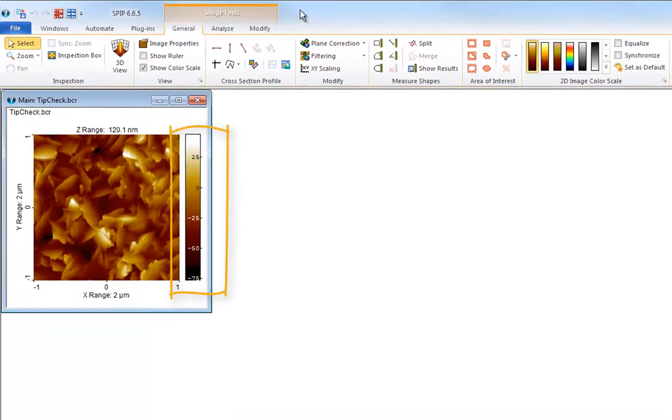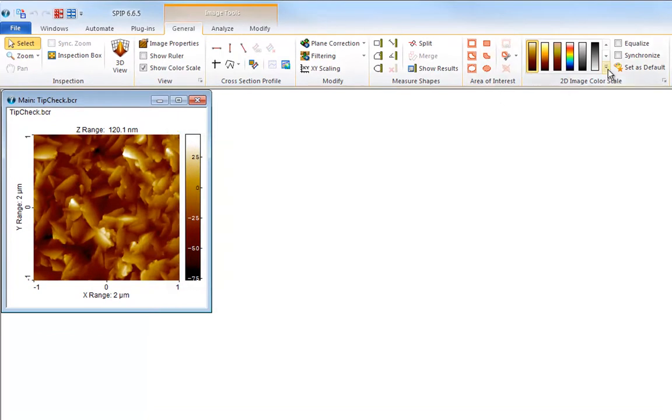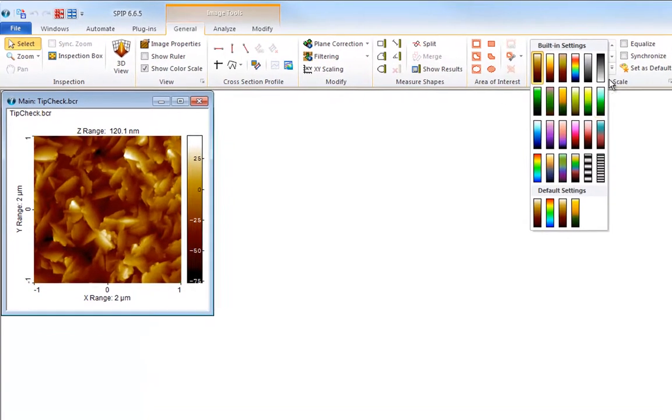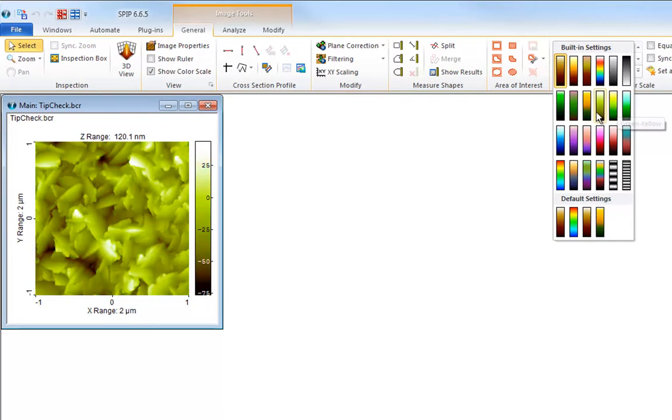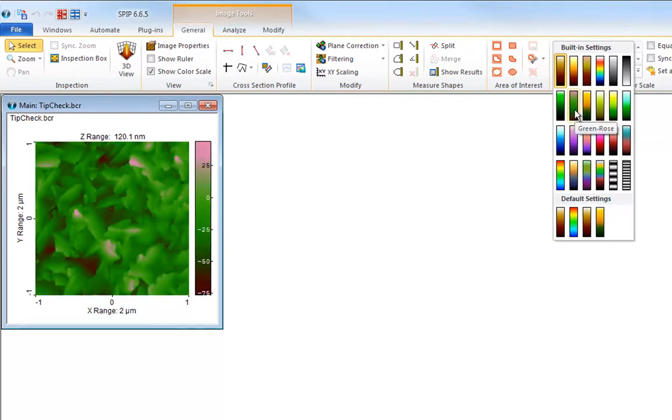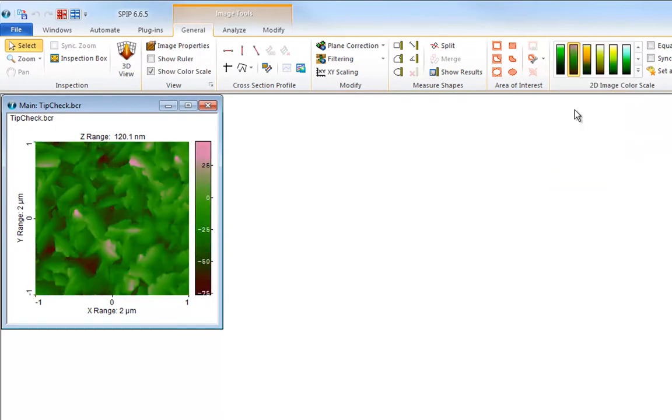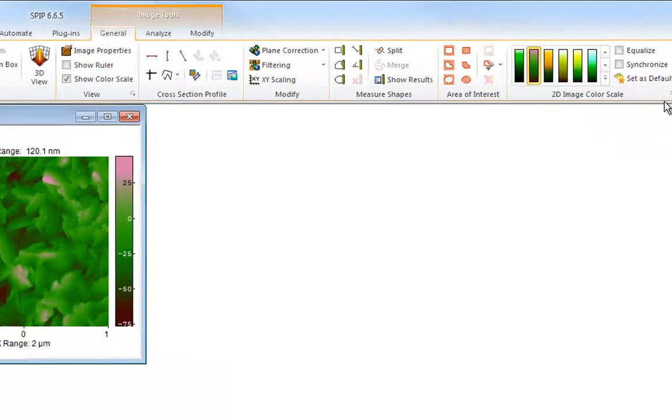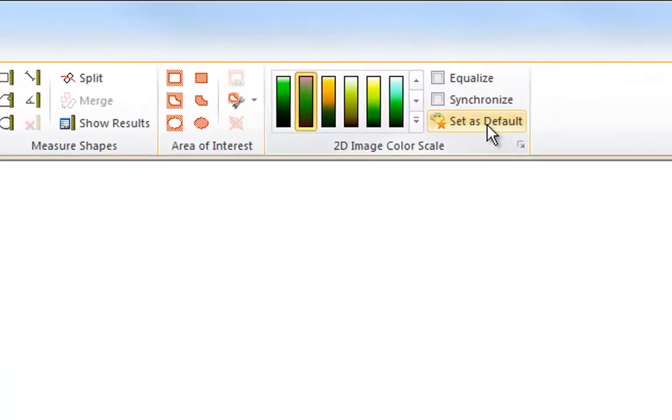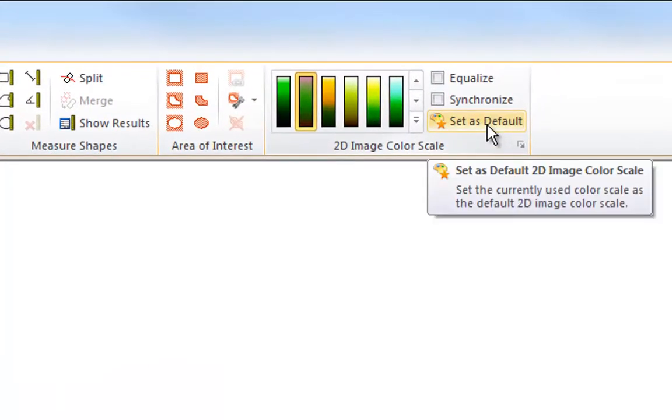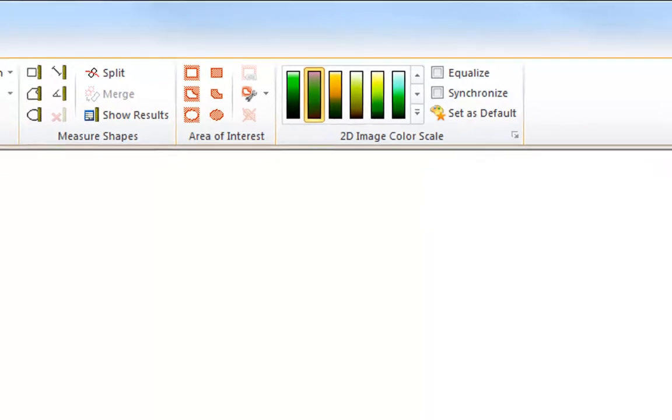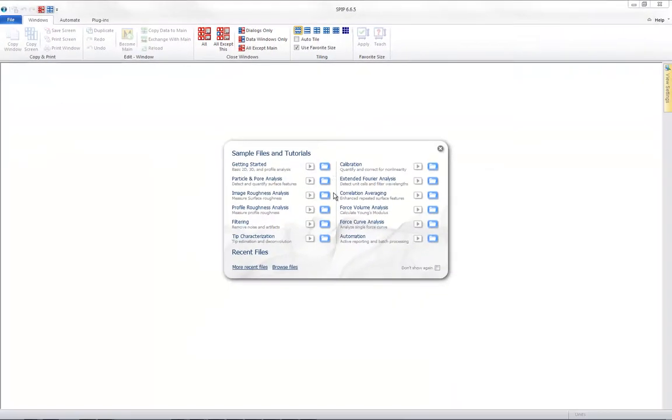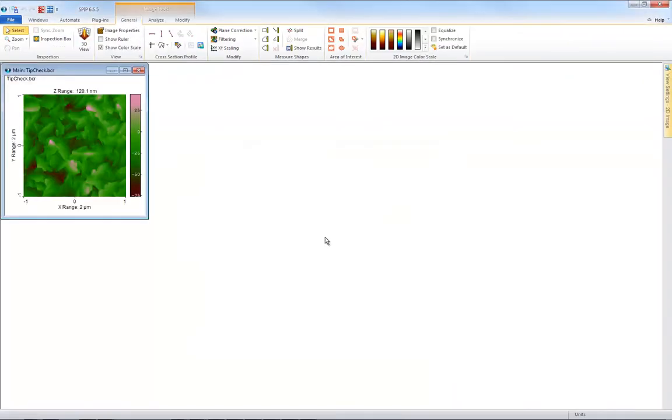Images always appear with a color scale representing the Z values in the image. 20 built-in color scales are available in the gallery on the general ribbon tab. To make the selected one your preferred default color scale simply push set as default. Next time you open an image it will be displayed with this color scale.